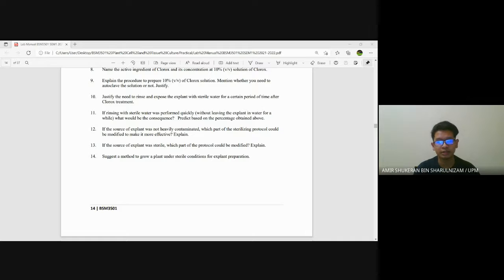And during the culture, the explant's temperature and light can be controlled in a culture room where the environmental factors cannot be disrupted by another environment. So for me, the best method is micropropagation. I don't know about you guys, but I think that's the best method.